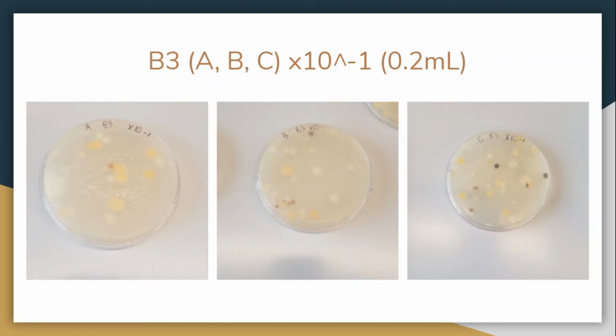The mean colony count for my plates is 1,733.33, and the standard deviation is 378.594. The large standard deviation number suggests that there is great variability between samples.